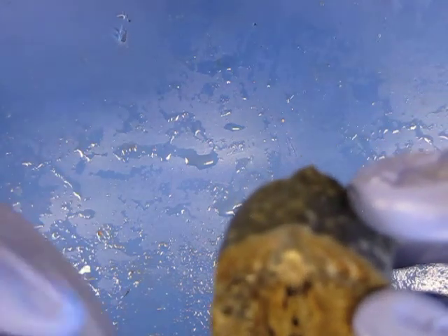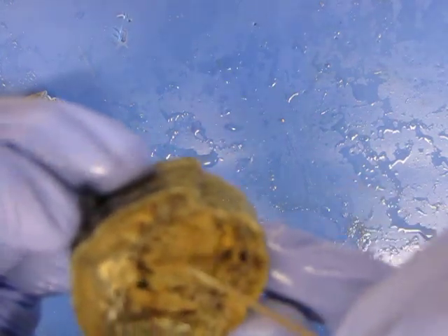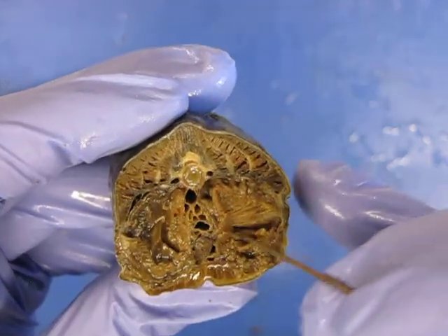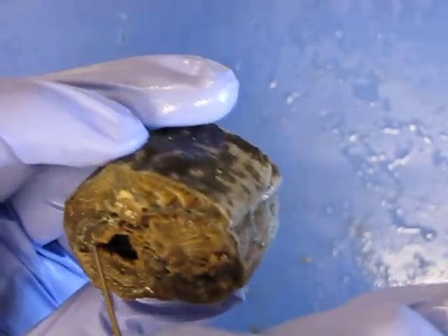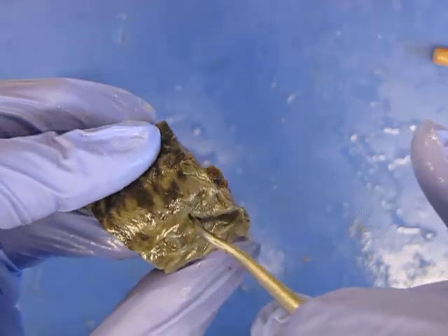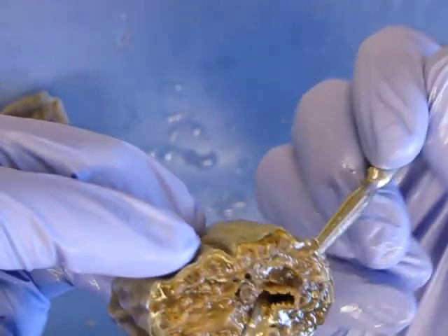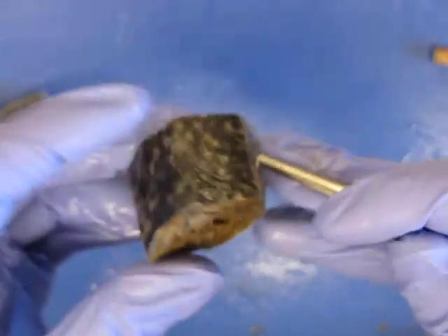Here you can see the filament sort of structure of the gill really well. So these are gills. That's where that gas exchange is going to happen. You'll probably find a pouch on one of these sections somewhere. You can see the gill pouch clearly. I don't want to use the sharper needle there because I'm more likely to do damage. Push your probe through and see how that goes through like that. Nice big pouch. Holds lots of water there for plenty of water to come in for gas exchange.